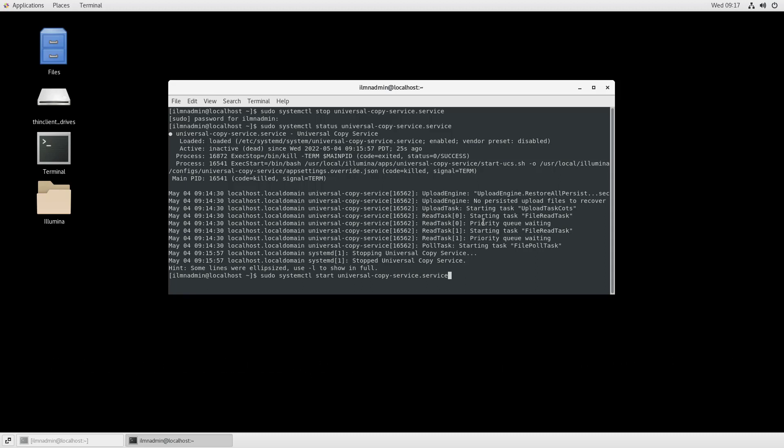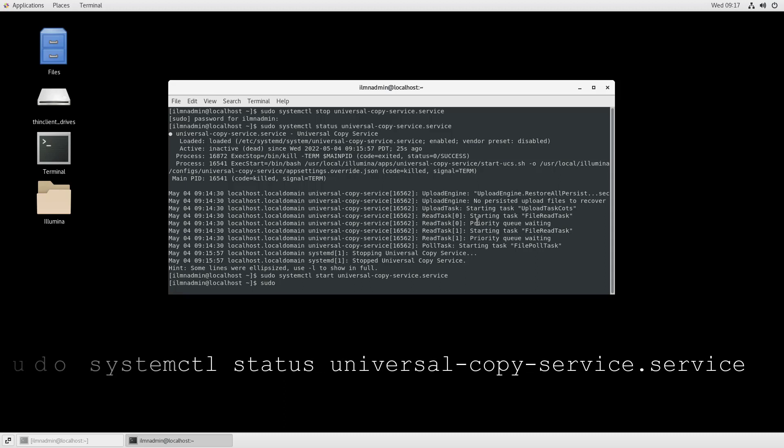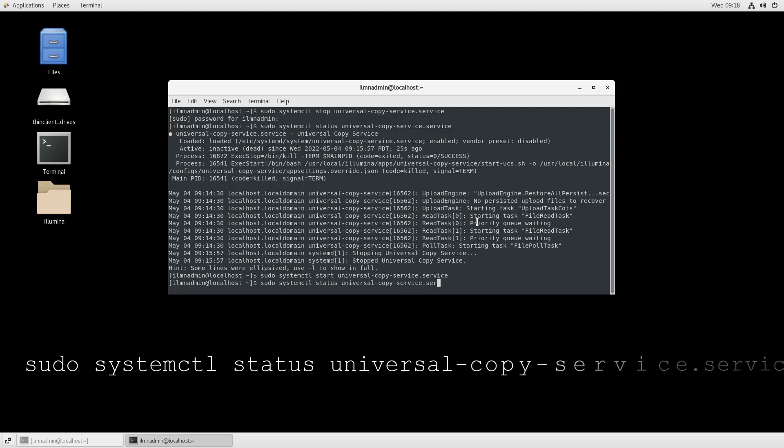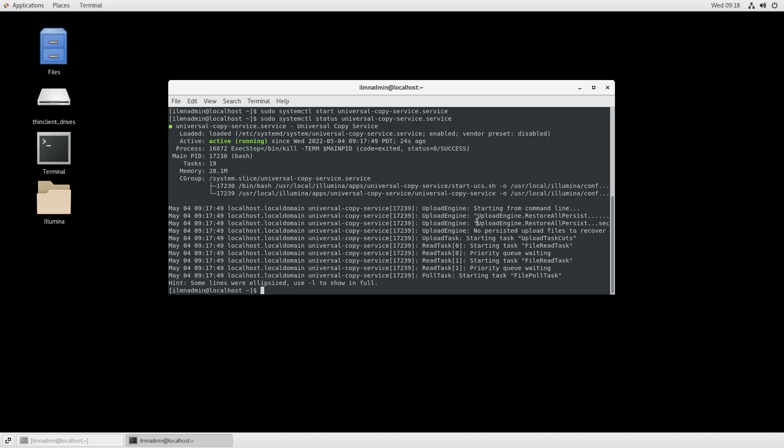To check the status of Universal Copy Service, type the command sudo systemctl status universal-copy-service.service. The service is now showing as active and running.